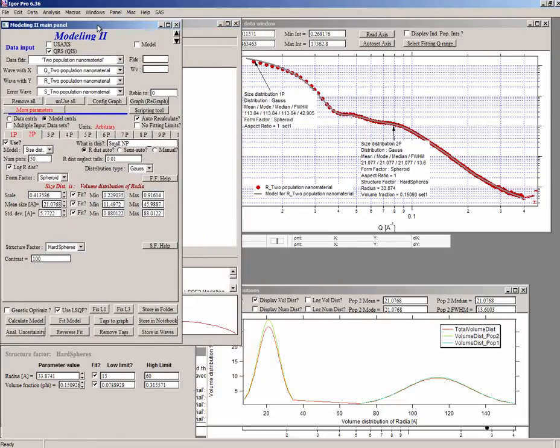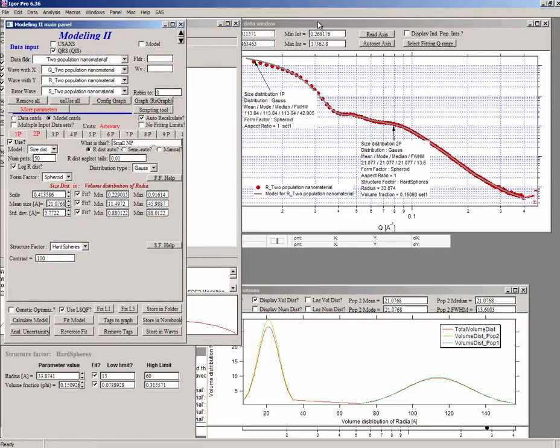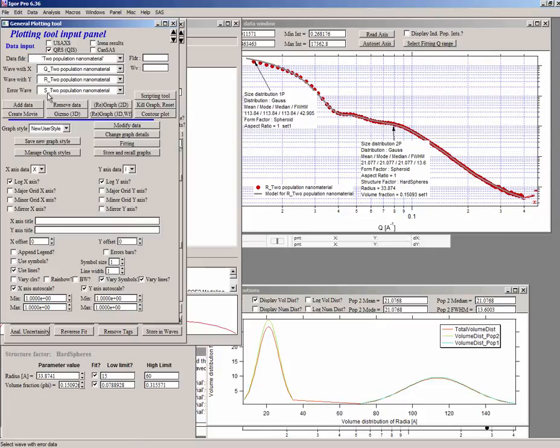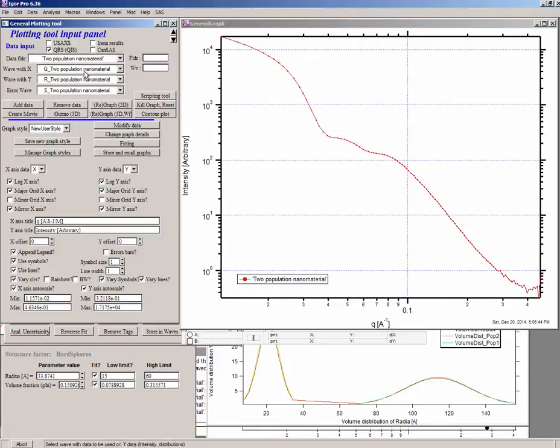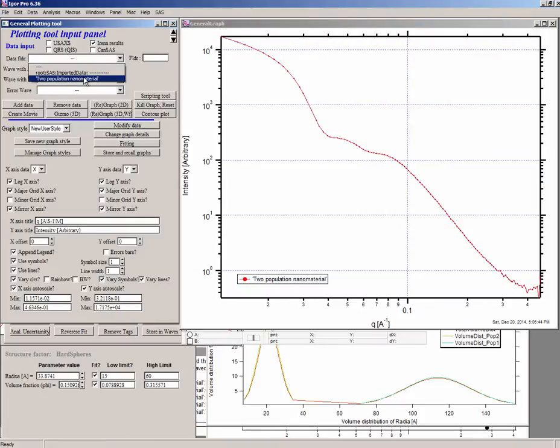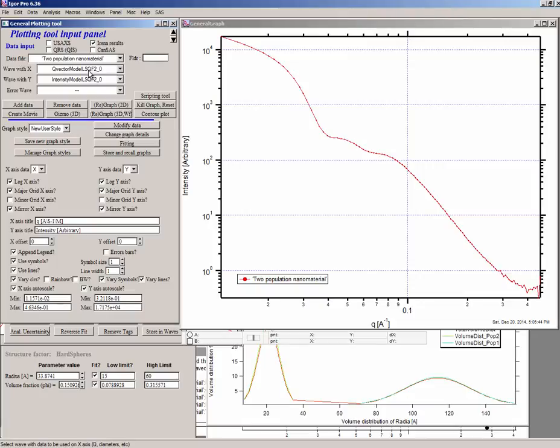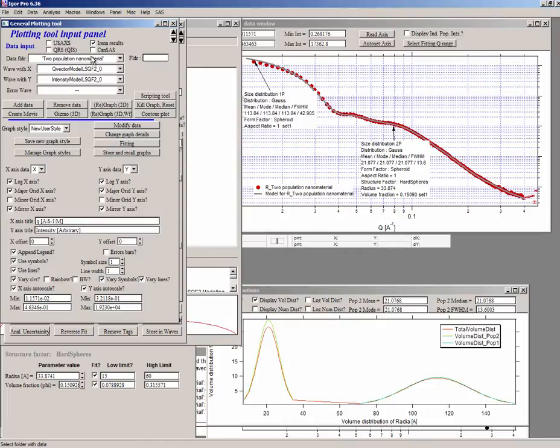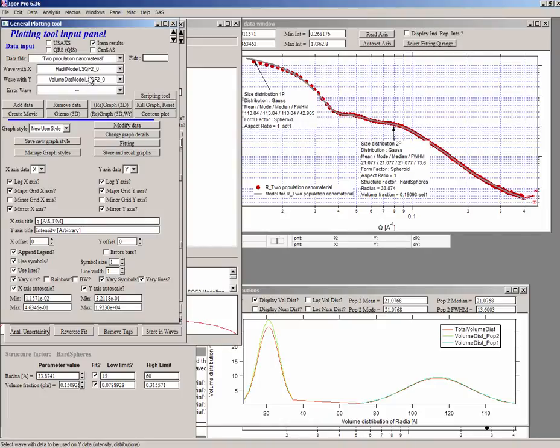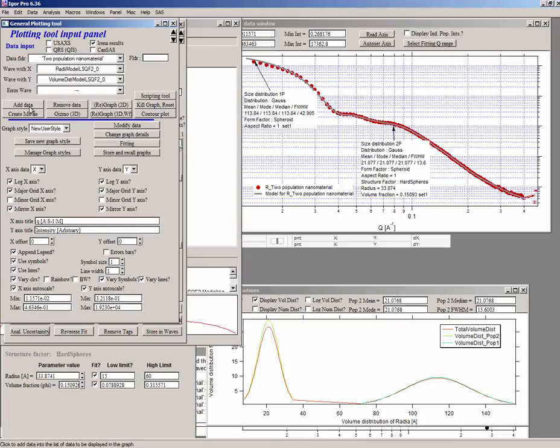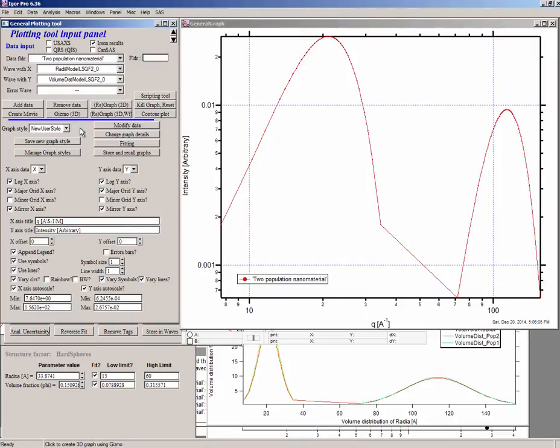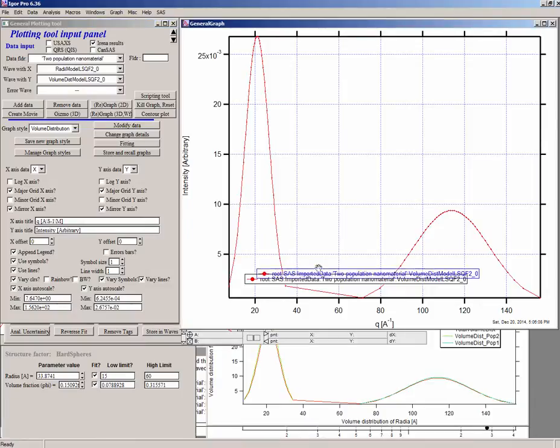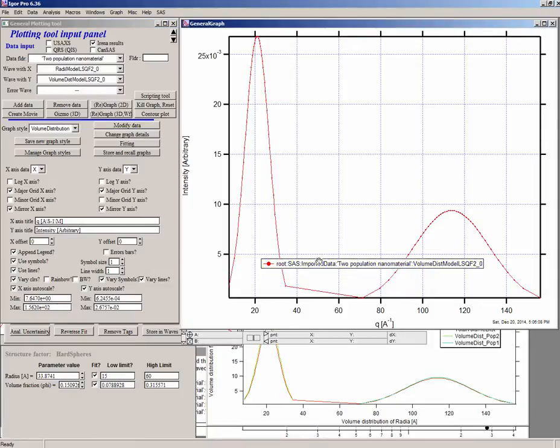You can then go and, for example, plot those. If you decide that you want to plot the results, you can go in to the plotting tool. You can either pick QRS, these are the data, and then you can say IRENA results. And in here you can pick the intensity and that would be an example of how you fitted the data. The other thing which you can do is you can go in and pick and say I have radii and I want to do volume distributions. Add it in and then pick a style which represents volume distribution. And here is your volume distribution.